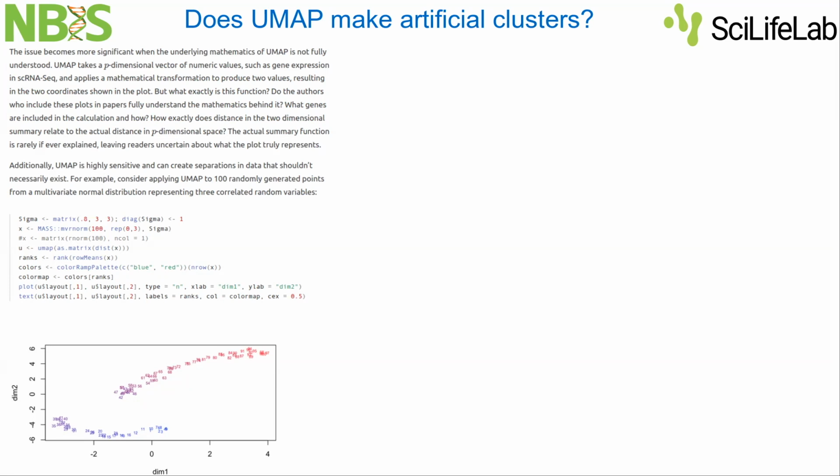So basically these hyperparameters in clustering algorithms, like resolution in Louvain or perplexity in t-SNE, can be tuned to get a picture that matches your intuition. There is no perfect right or wrong.